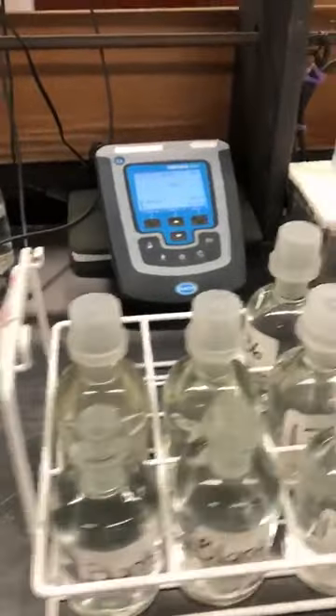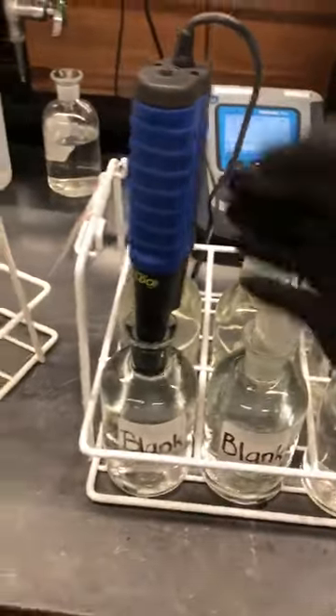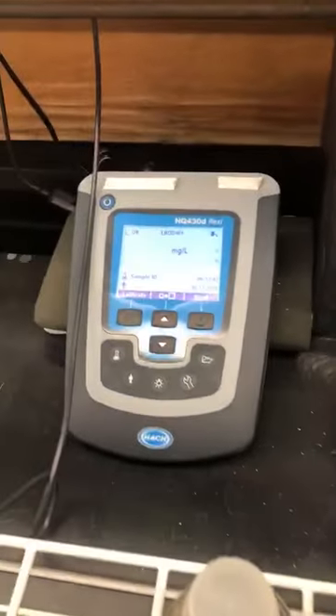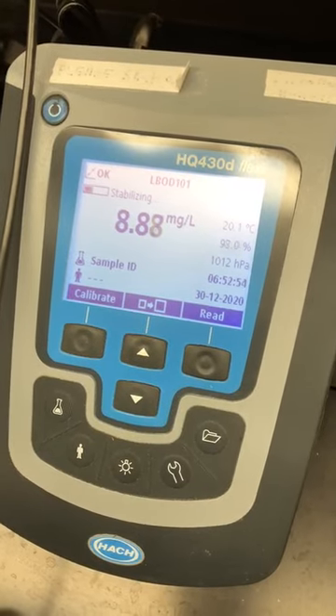Take out all the caps — the plastic caps and the glass caps. I take the probe for each of those. Make sure I press this button over here, and it's mixing and measuring. I press read for every sample when I want it stabilized. When it's locked, I record the number and write it down here for each of the bottles.